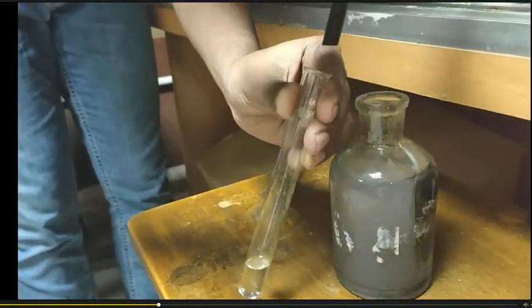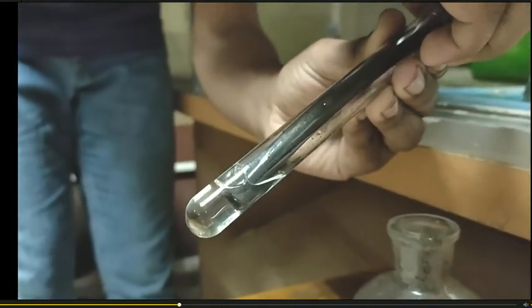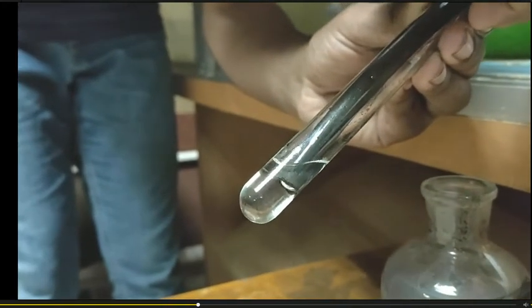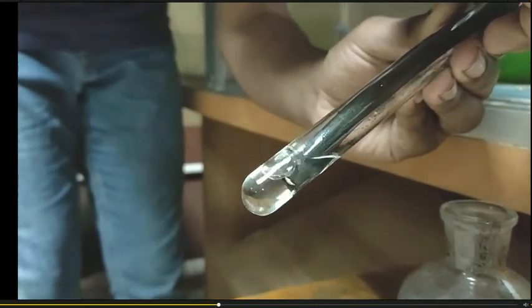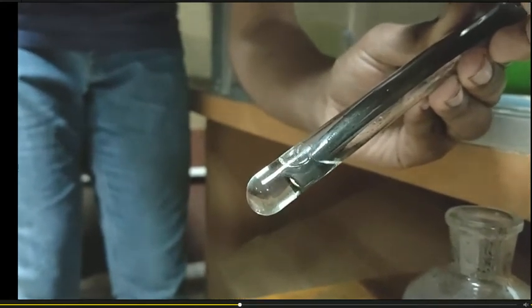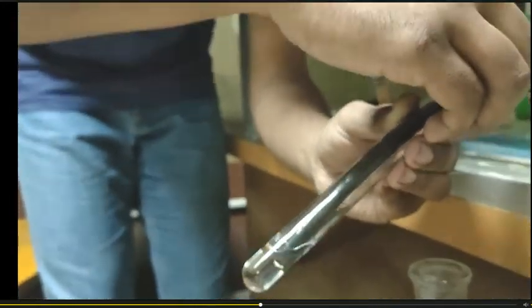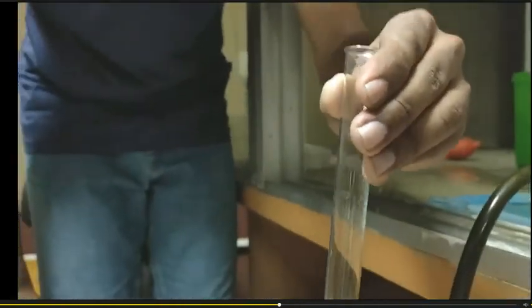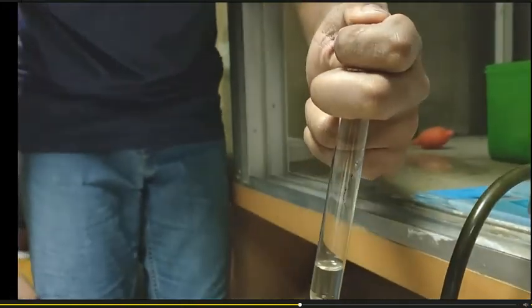Now we are applying hydrogen sulfide gas into this test tube, which is containing the hydrochloric acid and the sample solution. We are trying to apply a huge amount of hydrogen sulfide gas so that our later process becomes very easy. I think we have provided enough hydrogen sulfide gas. Now enough. That's all. The upper opening of the test tube should be covered with the hand so that the gas doesn't escape from the test tube.